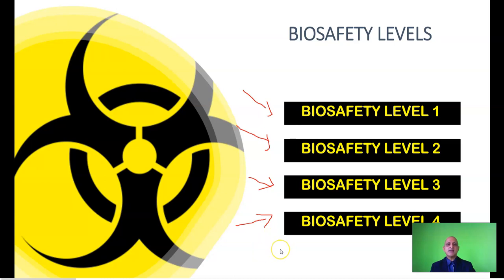these concepts with your engineering team before you design any biosafety level 1, 2, 3, or 4 facility. In technical terms, we refer to these as containment facilities, although the WHO refers to them as BSL 1, 2, 3 and 4. In the case of animal containment facilities, you will have the designation A. So this will become ABSL1, ABSL2, ABSL3, and ABSL4. That designates animal containment. And if you have a plus, it means enhanced. So BSL1 plus will refer to the enhanced biosafety level 1. I will explain that in the course of this lecture.